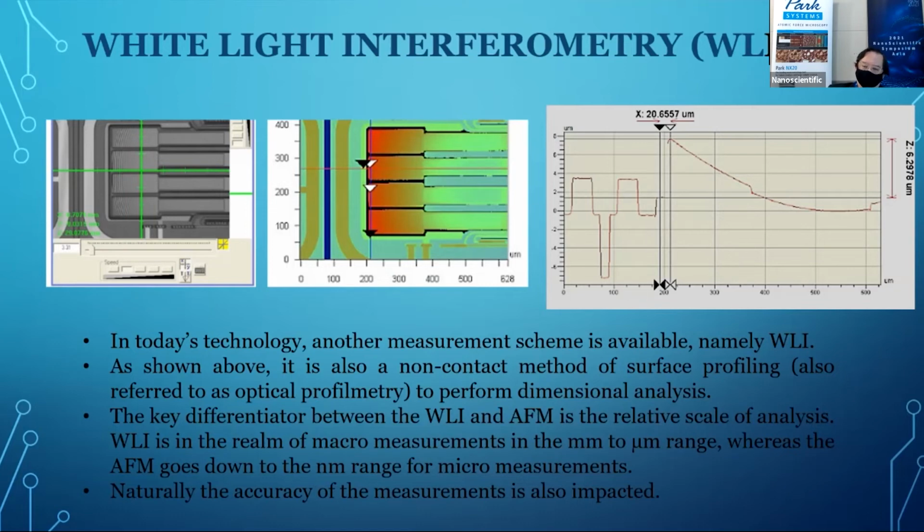Now let's digress for a second, right? Initially, we're just talking about scanning electron microscopes and AFMs. I will now bring in another technique found in today's market, for the interest of the general public: white light interferometry, or what we also call optical profilometry. In the past, we had physical profilers, meaning that you use a needle and go across the surface and quantify the surface. But that basically leads to scratching.